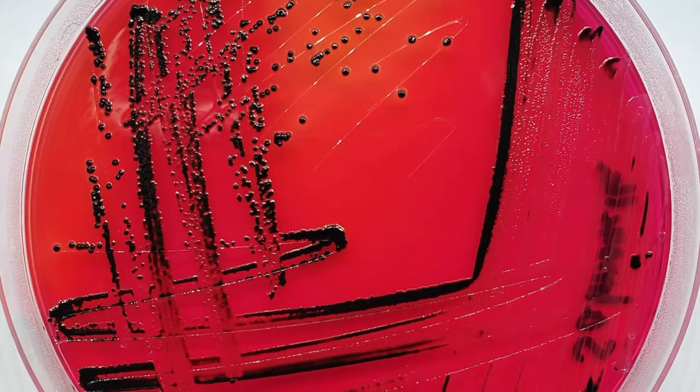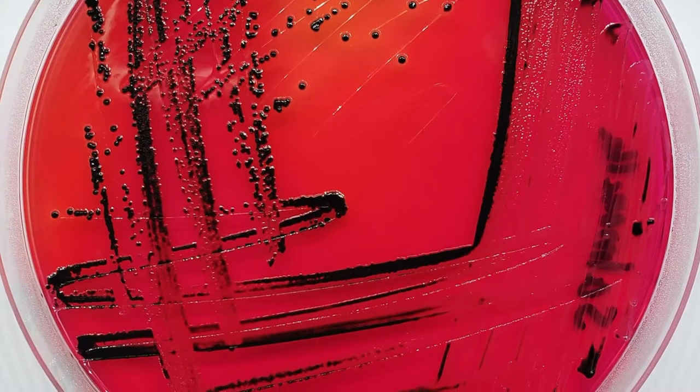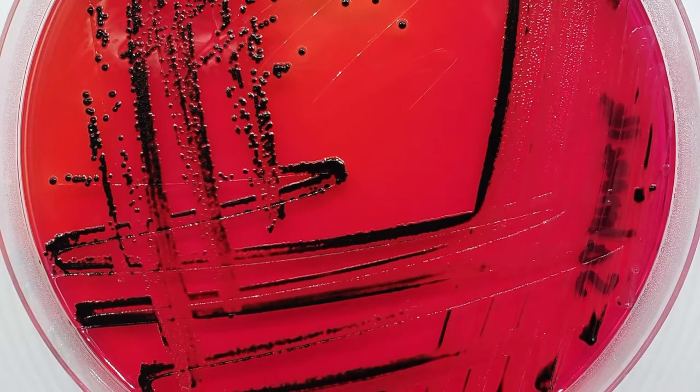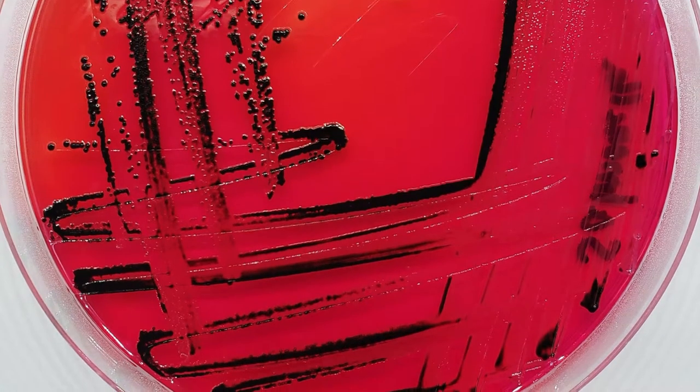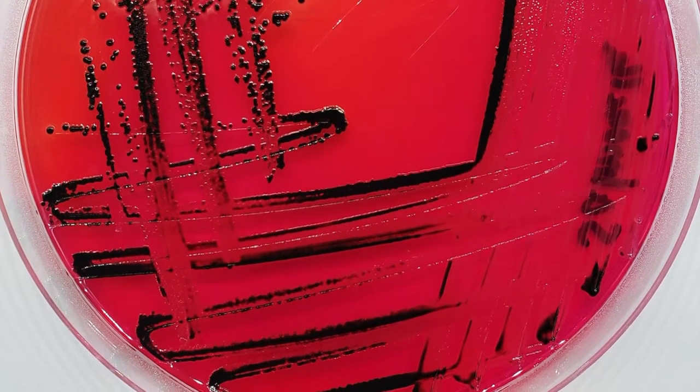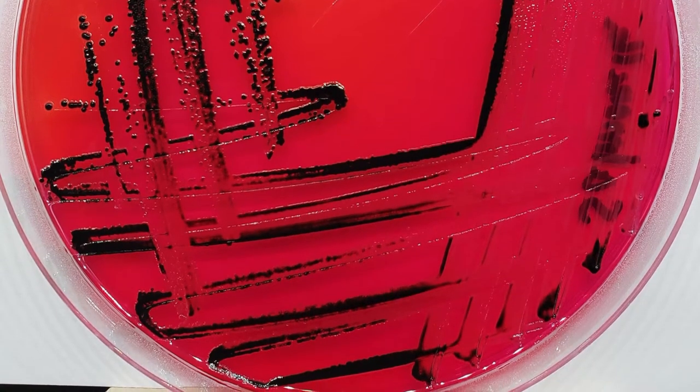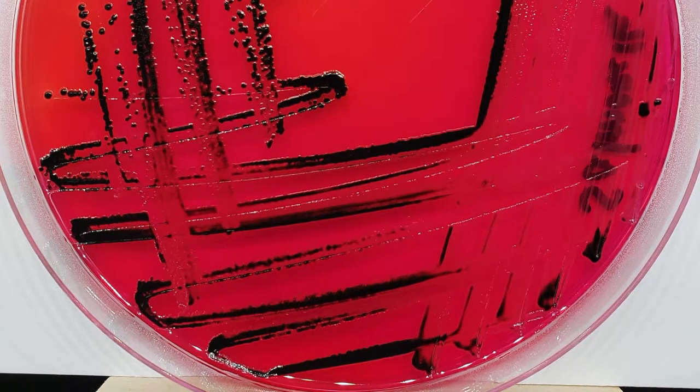We often use selective media, such as the plate shown here, XLT4, for the isolation of salmonella, if we're interested in trying to identify a particular bacterial species. While these media are very helpful as a primary culture step, we often only perform additional analyses on pure cultures grown on blood agar, therefore requiring a subculture step from our primary media.